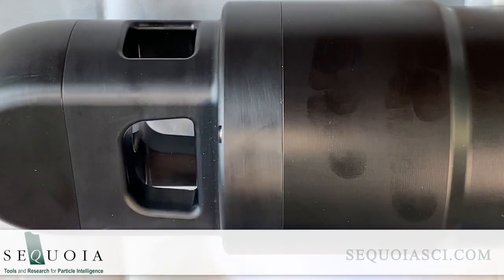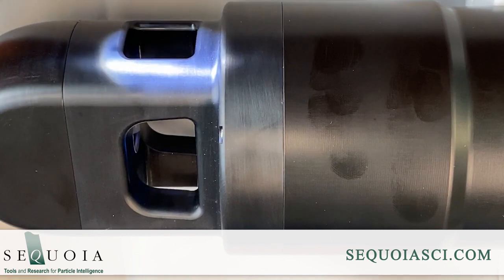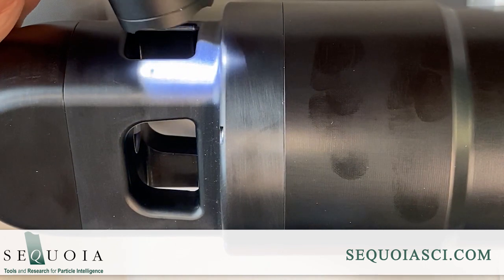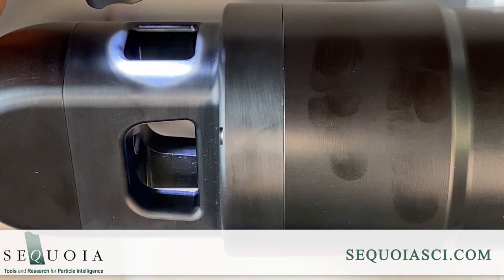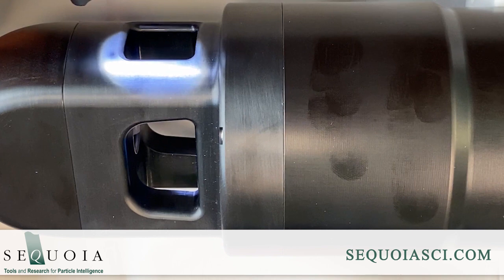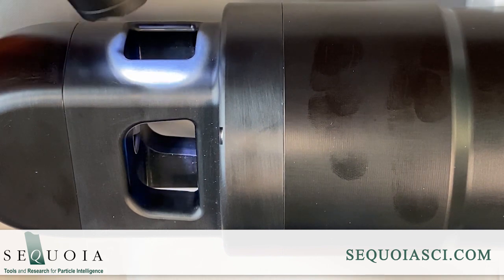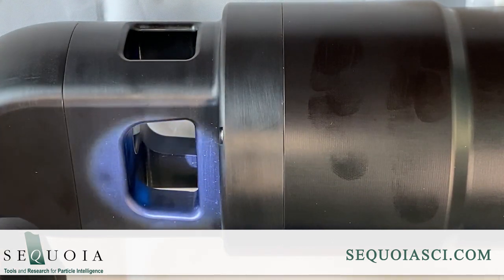The LISST-200X has optical windows which will require daily inspection and cleaning to ensure optimal instrument performance. Start by visually inspecting the optical windows to make sure that they are clean. There are two windows, the receive window, which is the larger window, and the transmit window, the smaller window. Both windows need to be cleaned to ensure quality measurements. The best way to check the windows is by using a flashlight.